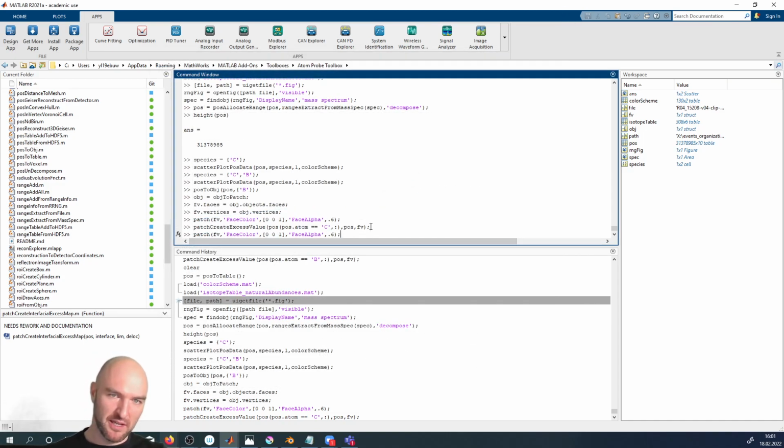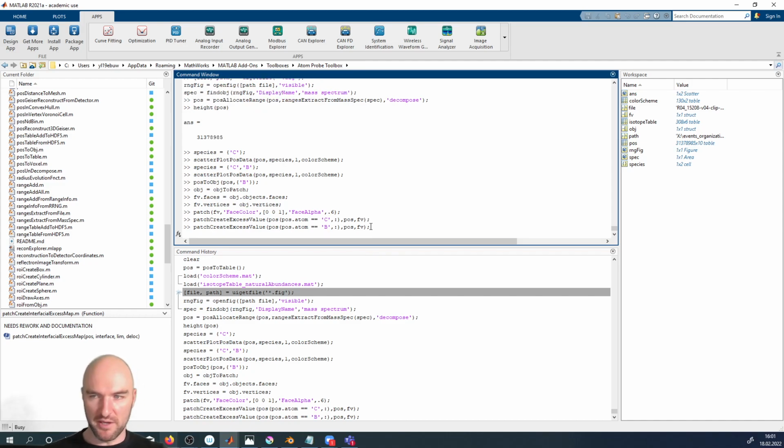So if we go and look at boron, I mean, we could do a proxygram and just look up which species are enriched. This is usually the starting point, and then just calculate the interfacial excess for the species that are enriched, because whenever you can calculate a proxygram, you can definitely calculate an interfacial excess value. You could even calculate interfacial excess values from proxygrams if you knew how many atoms contributed to each bin in your proxygram. If you have that information, you can calculate that the other way around as well. But using those cumulative curves, that's a bit more of a robust way to do it.